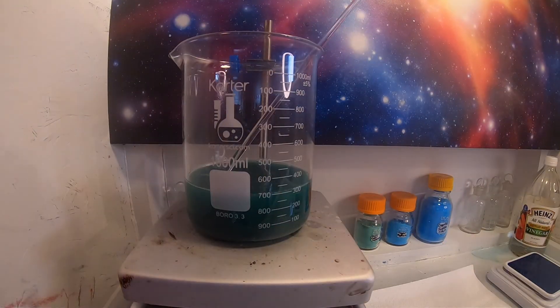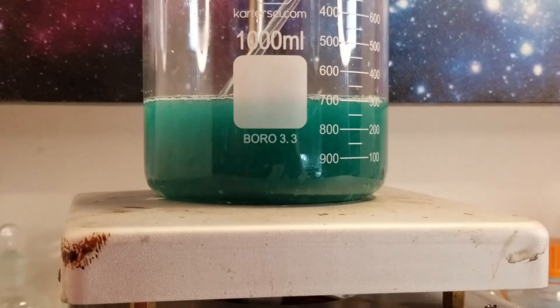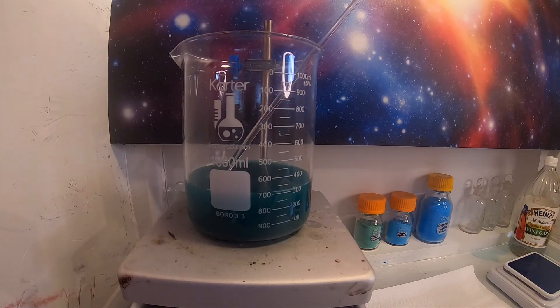I will now place this on a magnetic stirrer and heat to fully react. I really enjoy the color of this compound, so I'm going for a double batch.